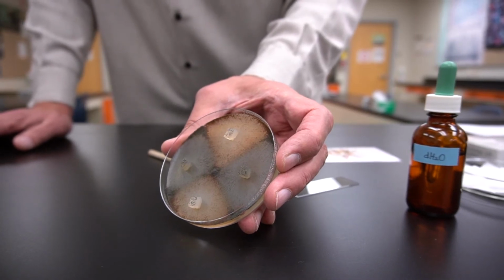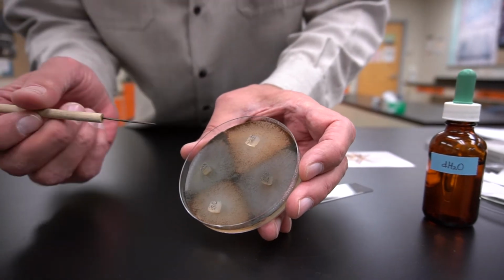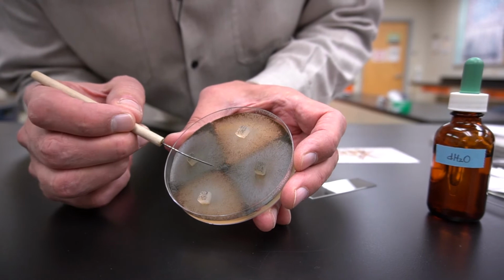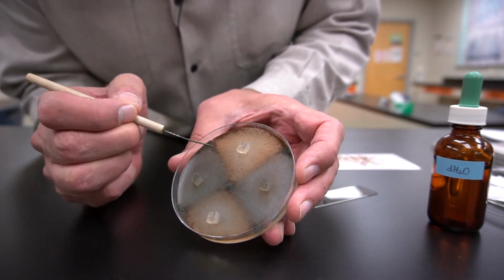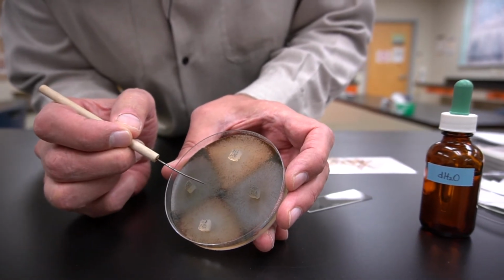And they create these 8 spore asci. And the 8 spore asci are contained within the little bitty black structures called perithecia that you can find piled up along the edges where these 2 different colors meet.